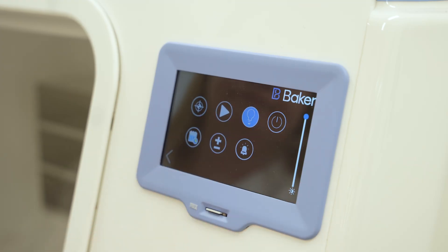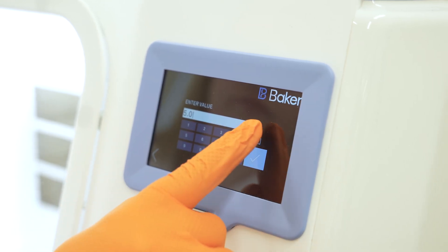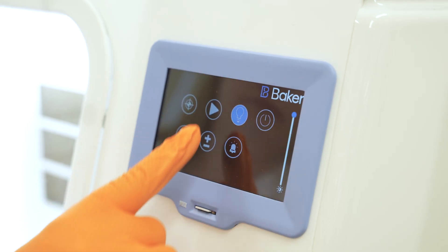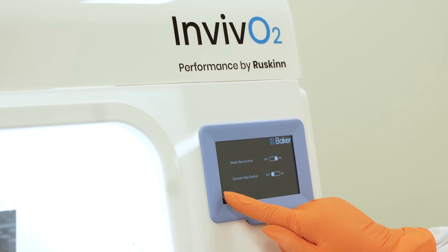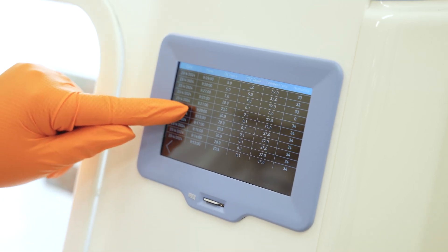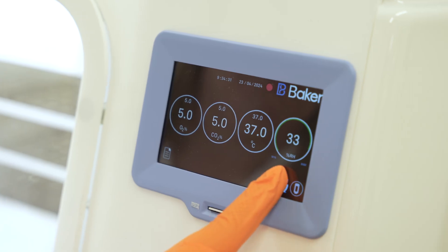The i300 features precision control of conditions from an easy-to-use touchscreen. Control of oxygen, carbon dioxide, temperature, and humidity allows you to mimic the physiologically relevant conditions of the originating tissue. The intuitive interface has data logging, file transfer, and programmable cycles, allowing you to set changing experimental conditions at desired intervals.